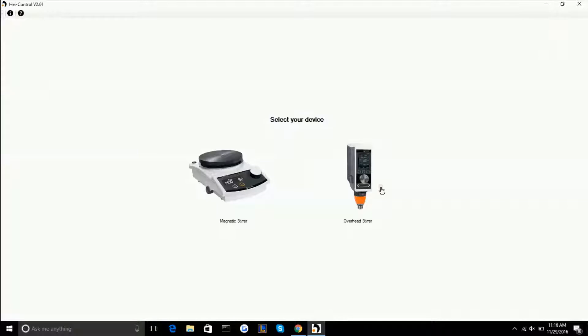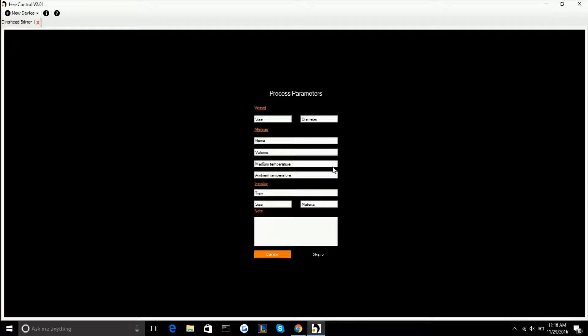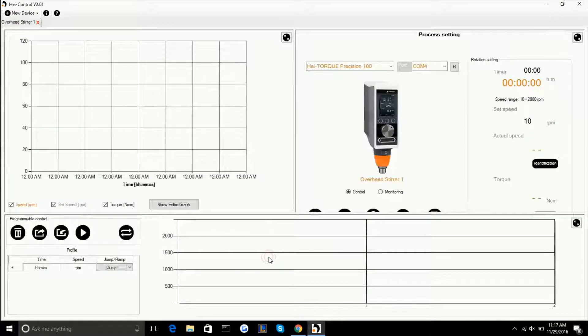We're going to select overhead stirrer and the first thing that pops up is your process parameters. This is kind of just a note to let you know what it is you're going to be working with in case you want to save your settings with a specific medium. So you can choose your medium, your impeller, write down some notes, and then move right on to the software.